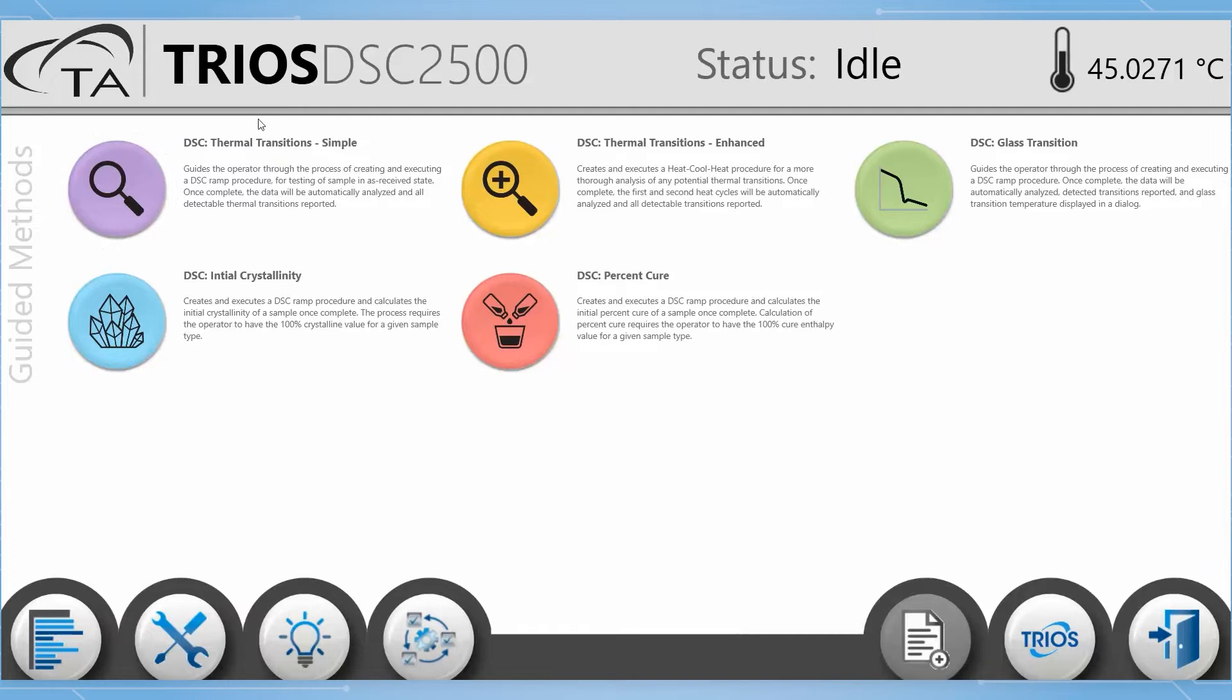In this Tech Tip we will walk through the features of both the DSC Simple and Enhanced Thermal Transition Guided Methods.